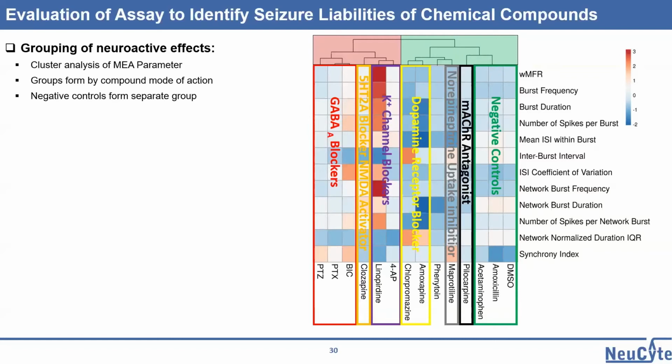If we take all this data collected and make just an unsupervised clustering, we end up basically with two trees: one that would be grouped as showing no effect, or would not be identified as a potential seizure-risk-bearing compound, versus the left branch here showing seizure-related activity patterns or profiles. And very interestingly, that nicely correlates with the pharmacological profiling data that we did before to characterize the functionality of those systems. I didn't show everything on the pharmacological profiling, but again, I'm happy to share these data upon request.